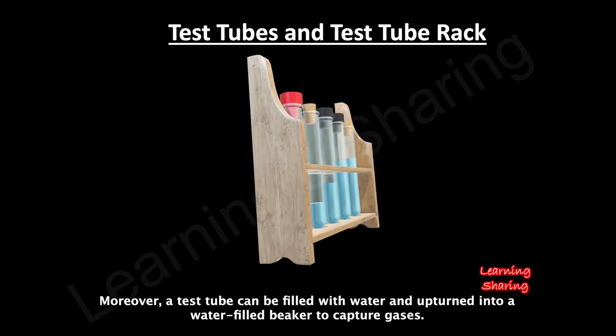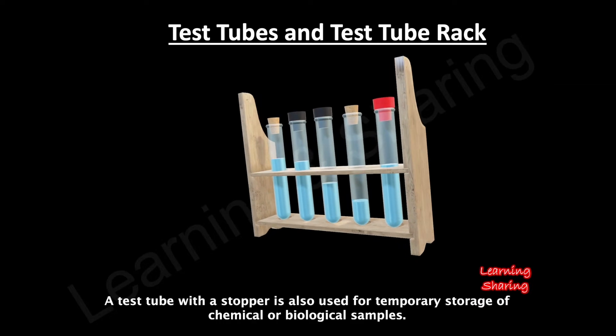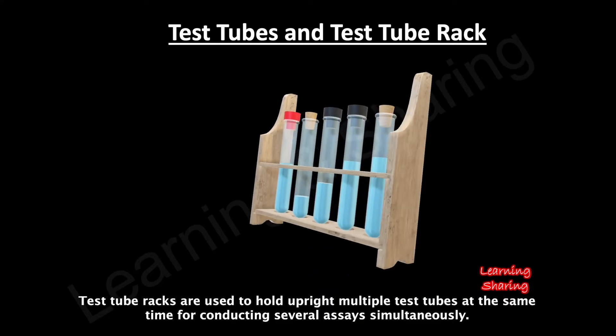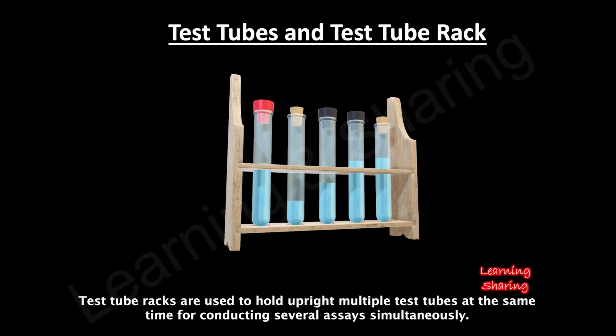Moreover, a test tube can be filled with water and turned upside down into a water-filled beaker to capture gases. A test tube with a stopper is also used for temporary storage of chemical or biological samples. Test tube racks are used to hold upright multiple test tubes at the same time for conducting several assays simultaneously.